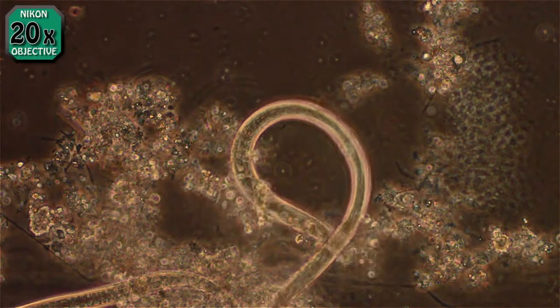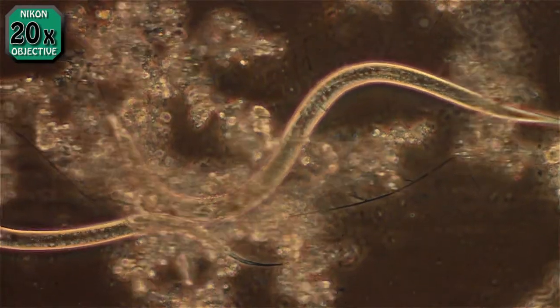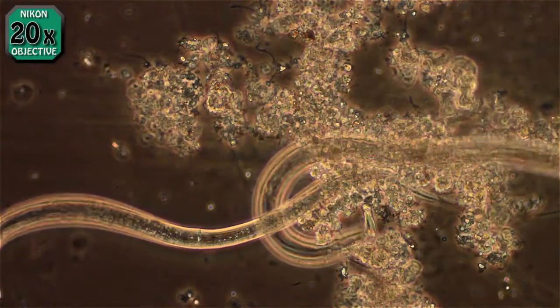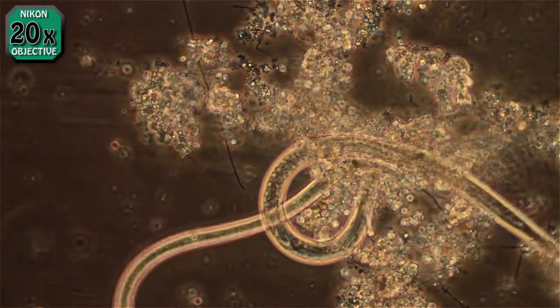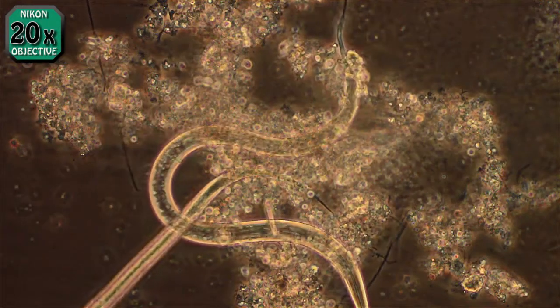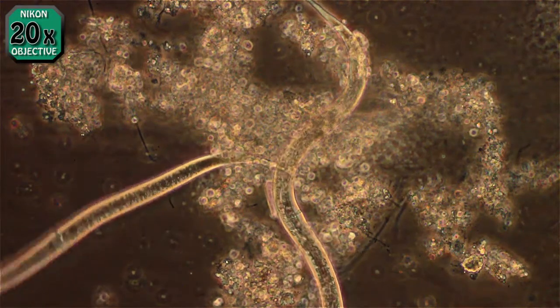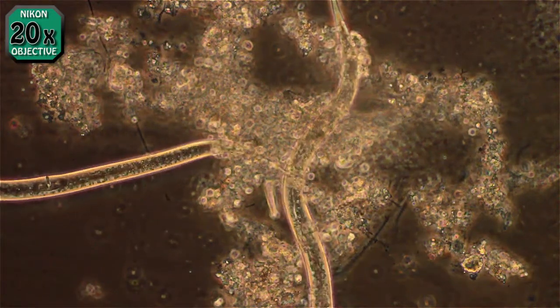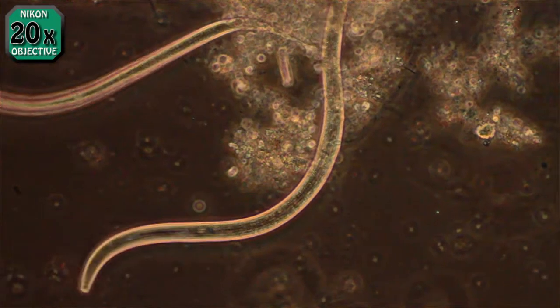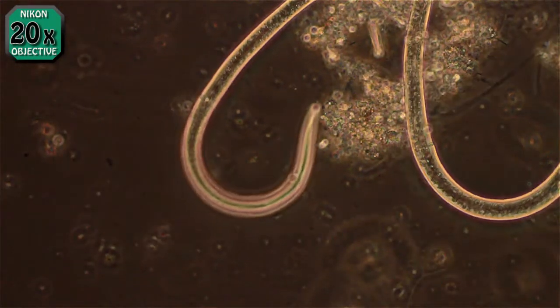I've done this several times, and this is the first time I've ever seen nematodes. I don't know if these are males or females — I have seen them with eggs before, but none of these in the recent batches have shown any eggs. So possibly these are young ones; I don't know where they came from.